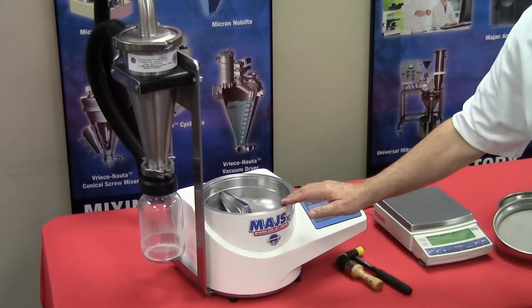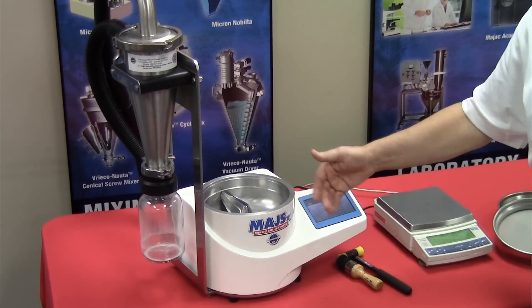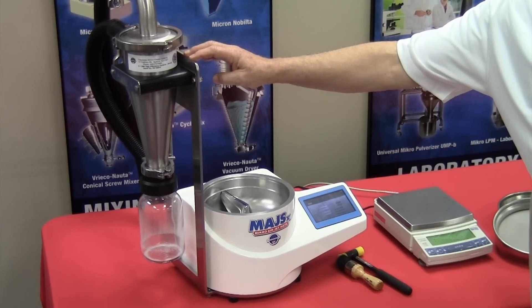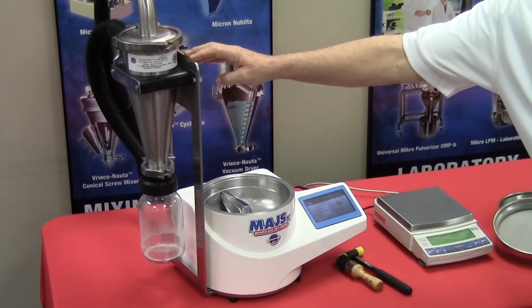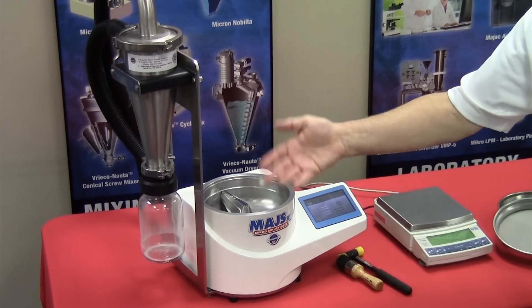Also, there is an automated vacuum pressure control valve embedded in the unit that permits accuracy for vacuum pressure throughout the process. And lastly, the optional cyclone has an efficiency of 99% at 10 micron to enable clients to further analyze product once collected.